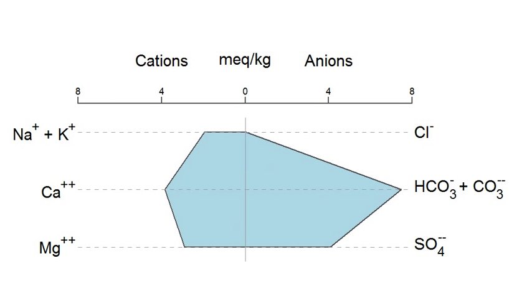Today I'll show you how GTPLOT creates stiff diagrams from the data in your GSS spreadsheets.